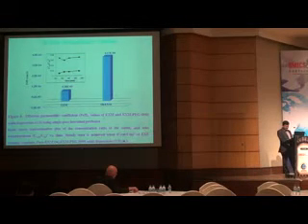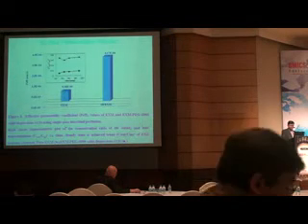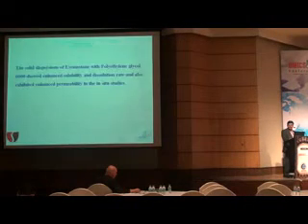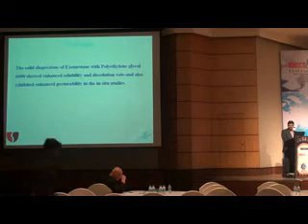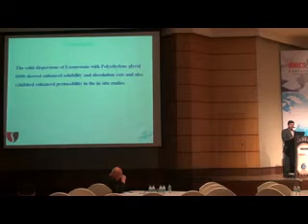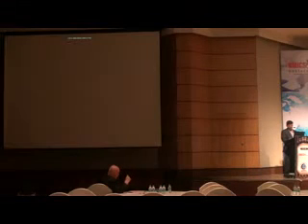So this was further studied in the permeability study, and this was the data for the dissolution, understanding the dissolution parameters, that is Q15, the amount of drug released in 15 minutes, and Q60, that is at 1 hour, and dissolution efficiency at the same 15 and 60 minutes, and mean dissolution time. So the decrease in MDT indicates the increased dissolution rate. Similarly, the dissolution efficiency values also suggest the increased dissolution rate with the solid dispersion 1:9. The same is the case with the initial dissolution rate values.